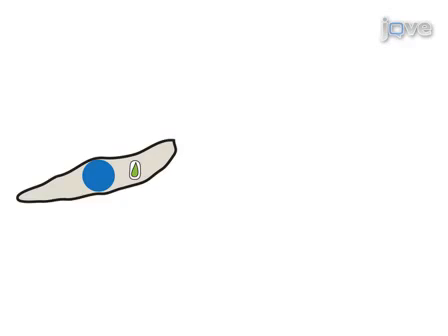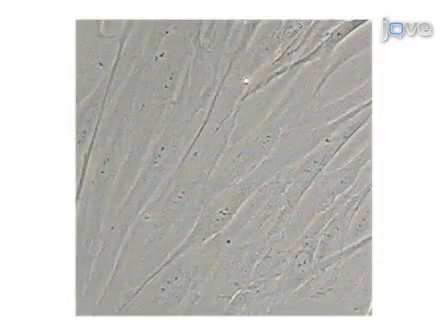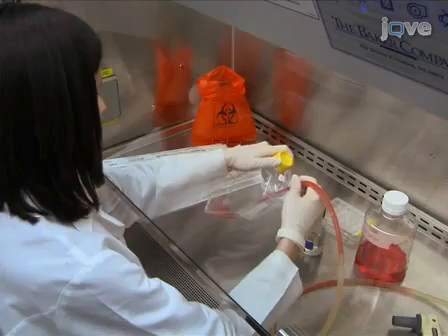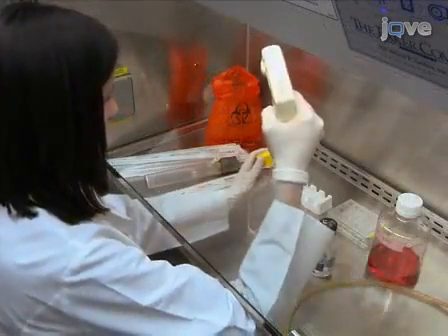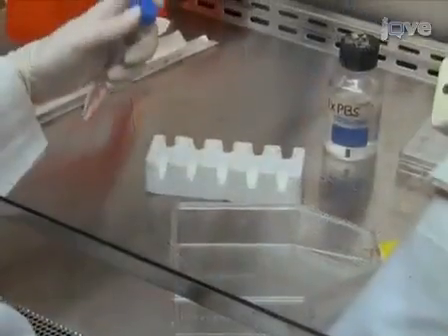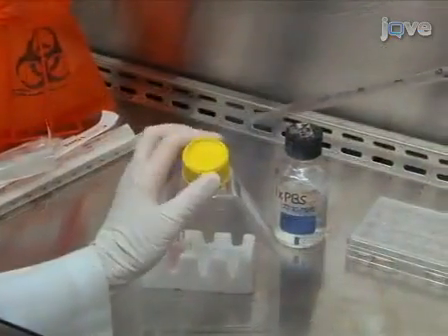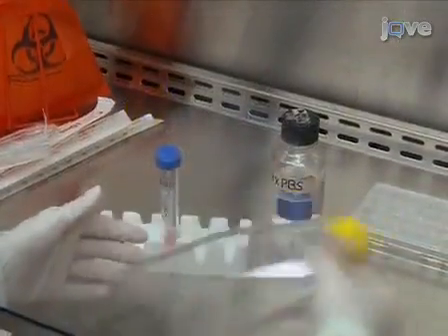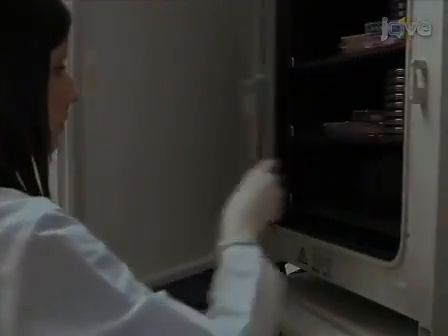To induce the conversion of Toxoplasma gondii to bradyzoites in human foreskin fibroblasts under conditions of high pH and carbon dioxide starvation, start with a confluent 150 square centimeter flask of human foreskin fibroblasts. Under a tissue culture hood, rinse the confluent flask of human foreskin fibroblasts 2 times with 1x PBS and then add 2.5 milliliters of 0.025% trypsin EDTA. Incubate the flask at 37 degrees Celsius for 5 to 10 minutes.